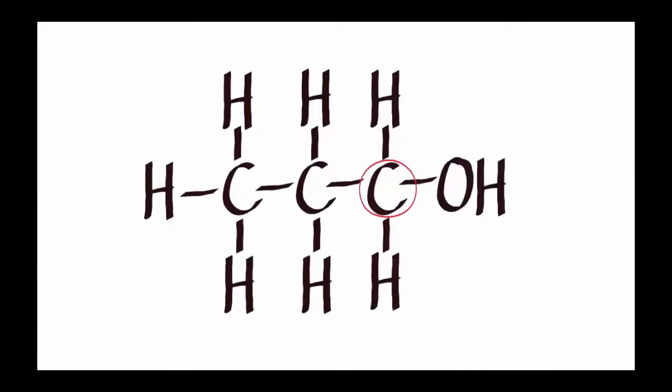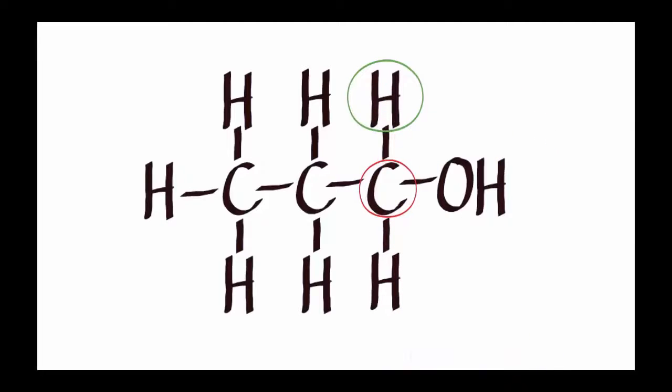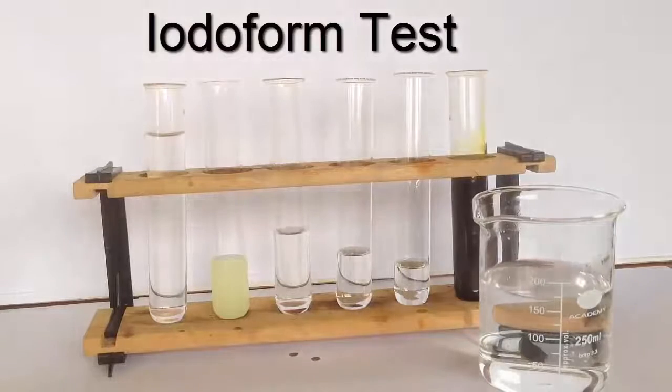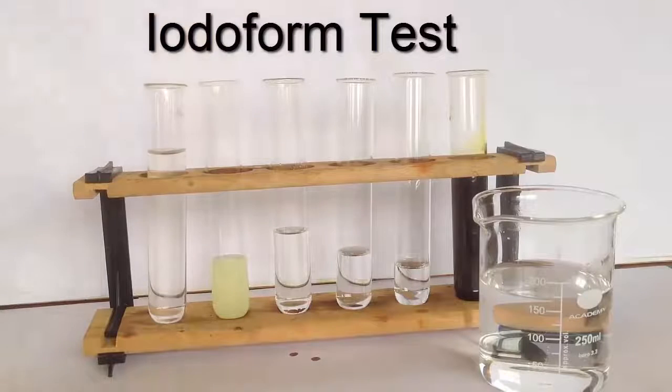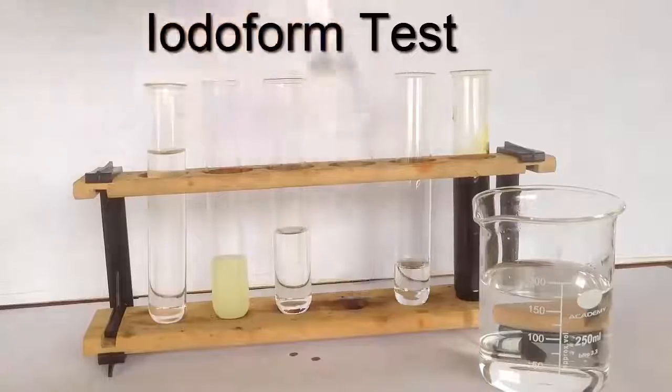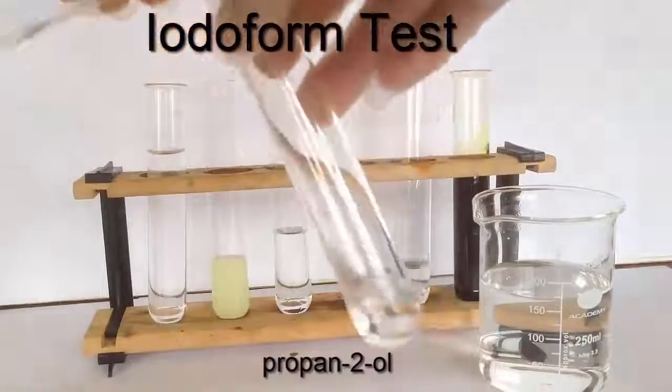There's the key carbon in question that's attached to the OH. Well, it is indeed attached to an H, but you'll see it's not attached to CH3. It had an ethyl group instead of a methyl group, so that was the correct result, negative. Let's move on to the position isomer of propan-1-ol. That's propan-2-ol.